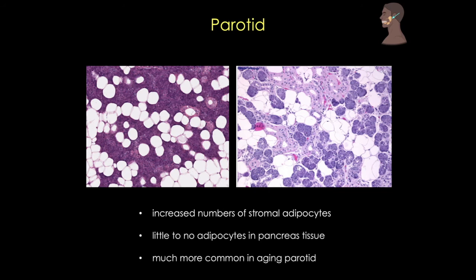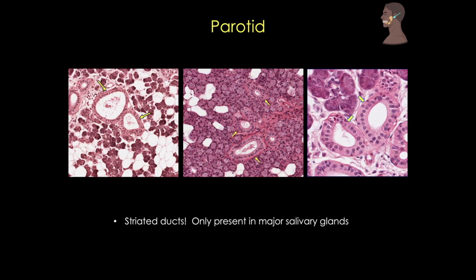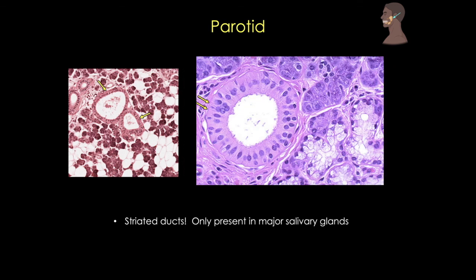This is especially true of the aging parotid gland. The second distinguishing feature of the parotid gland — well, all of the major salivary glands really — is the striated duct. Within each lobule, there are several prominent ducts with more distinct lumen that stand out sharply from the surrounding acini and are also more acidophilic. These are the striated ducts, which are considered intralobular ducts, meaning they're still within the parenchyma of the lobe, not in the connective tissue between the lobes. These duct cells have a folded basal membrane that looks almost striated — almost like stripes or parallel streaks — and you can see these striations more easily in the magnified image.